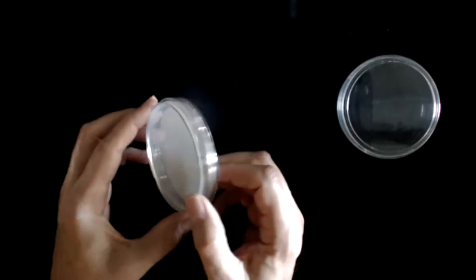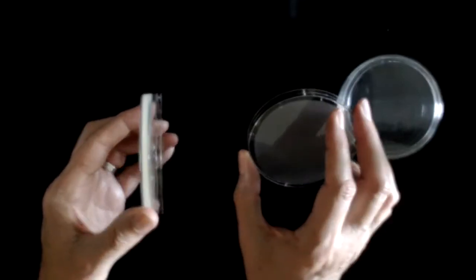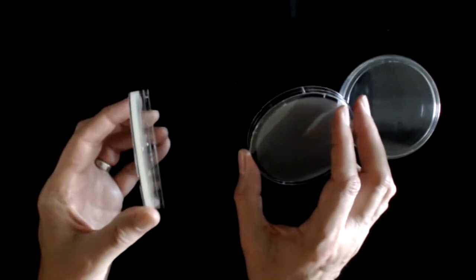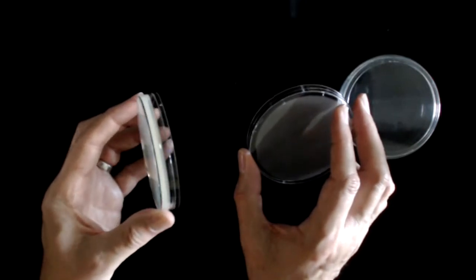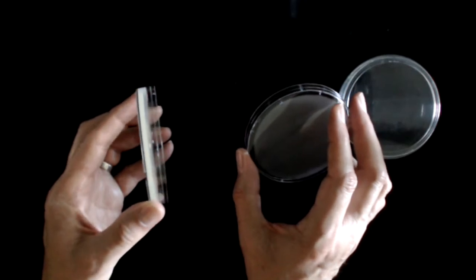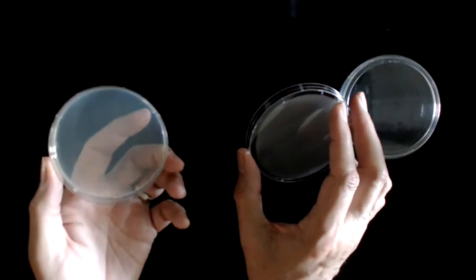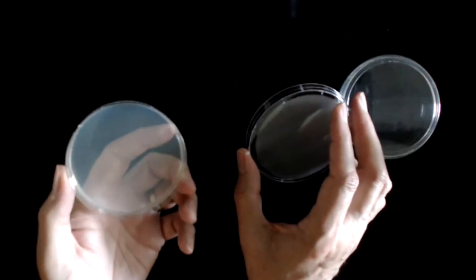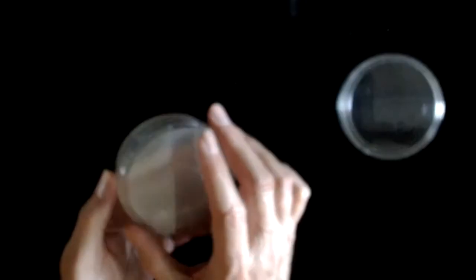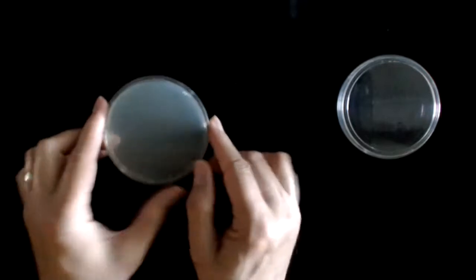And as I turn the plate on edge, and you can see me taking the top of the plate off, you'll see that there is a layer. If you're looking at the bottom here with an edge view, you'll see there's a layer of a substance that we generically refer to as an agar. So there is sterile agar that has solidified in the bottom half of this petri dish. Together, the top and the bottom are usually referred to as an agar plate.